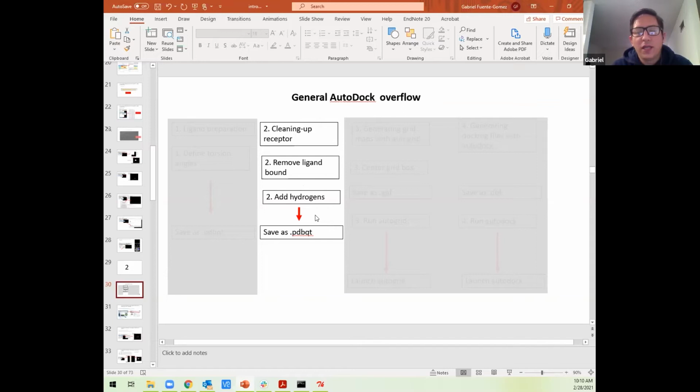So I'm going to go now to AutoDock Tools. And for the people that have not installed it, I'm sorry guys, but just try to pay attention for now. Next week you can ask me anytime, or if you guys want to meet later, I can do it. I'm going to be available for you guys, so no problem with that. Okay, good, you installed it.